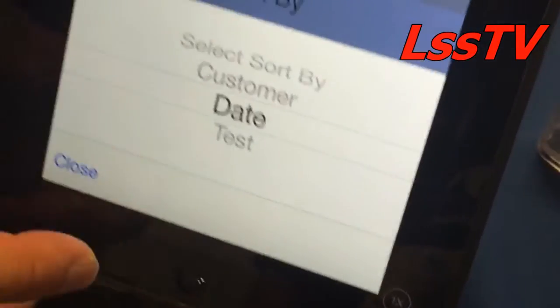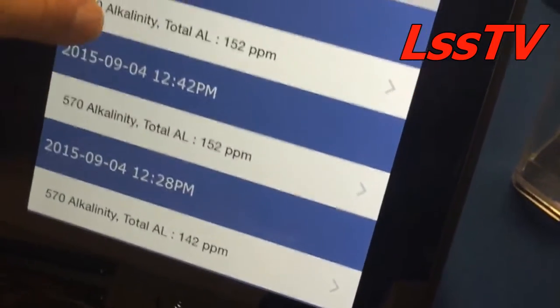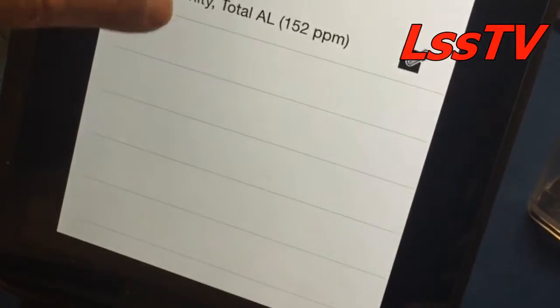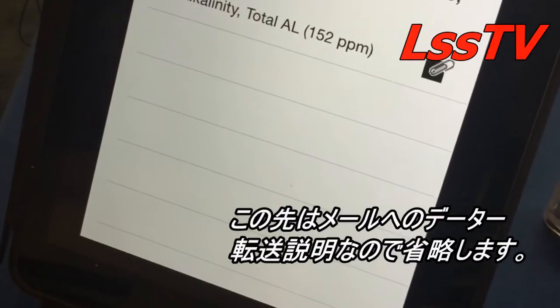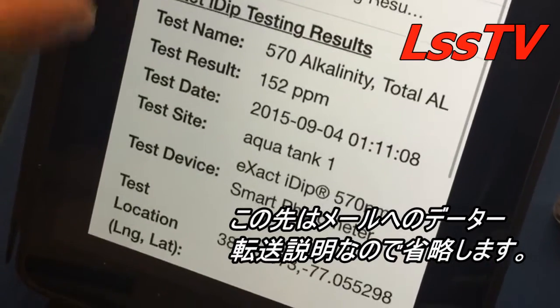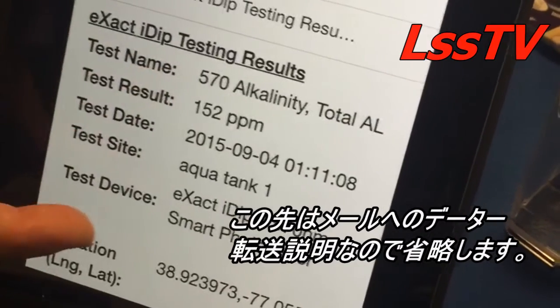We can email the results. I have so many tests in so many different locations. I went to date, knowing that the most recent date is right here. I touch this — here it is. You see the little paper clip? It shows that there's a comment made. How would you like to email the result? I just touched email, and this is what you will get — the exact I dip, 570 nanometers.